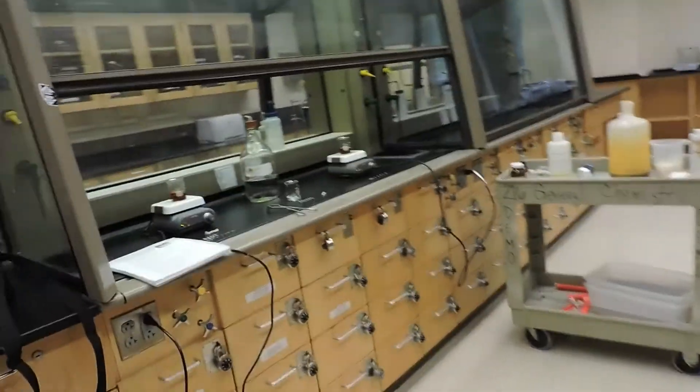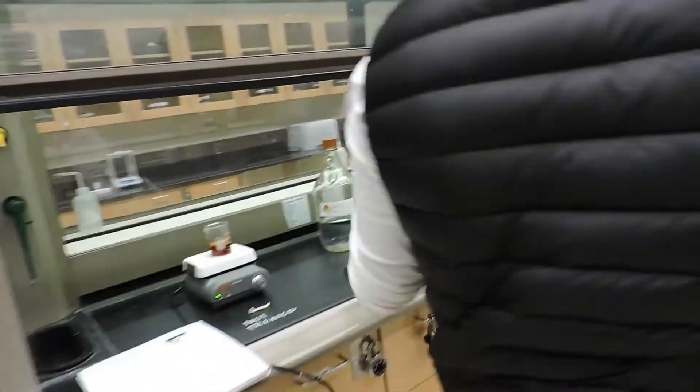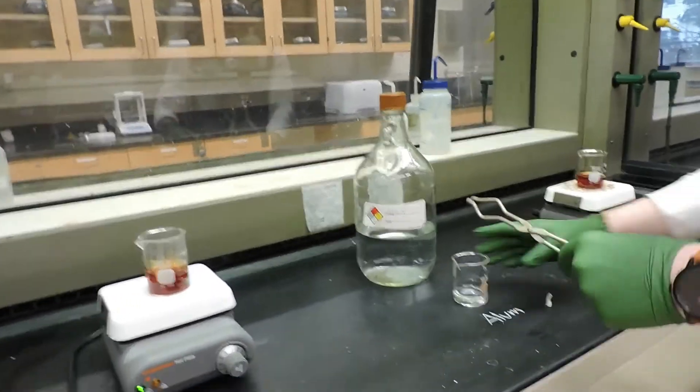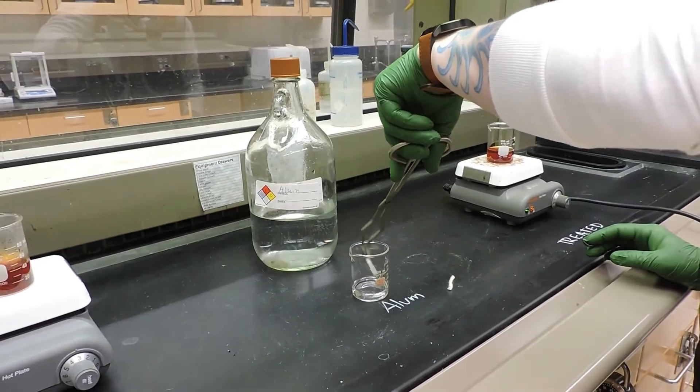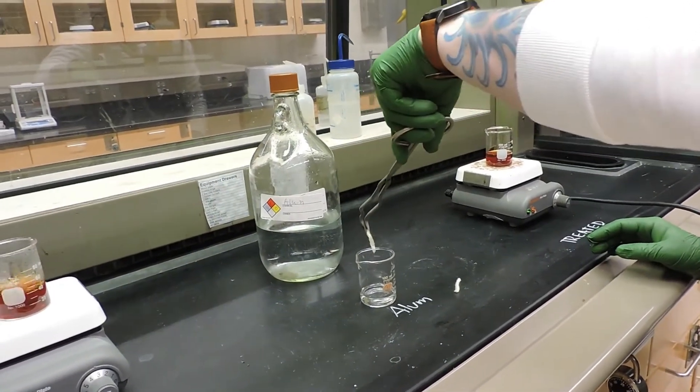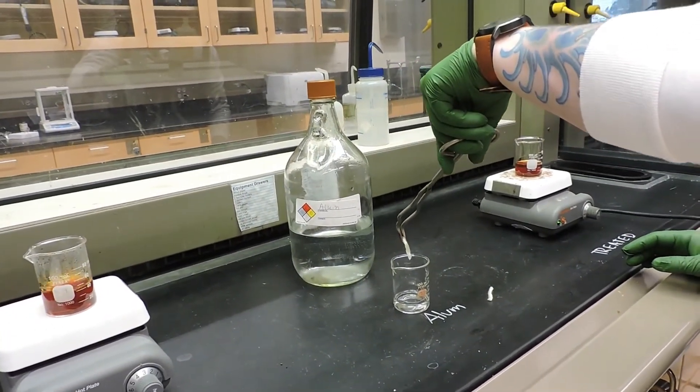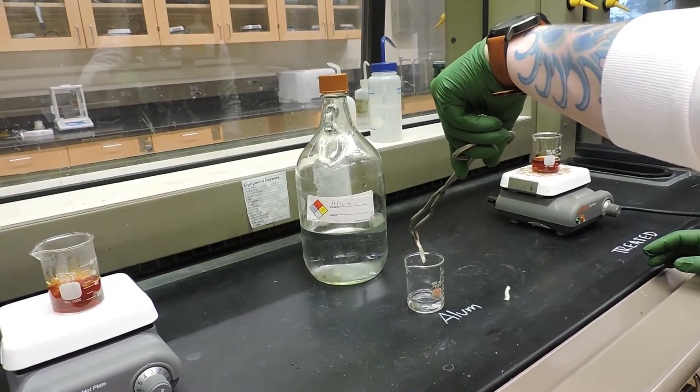All right, now we have the piece of wool in the alum bath that has been sitting for a couple minutes. So we will remove that, rinse it with water, and then we will immerse it for two minutes in the hot solution.